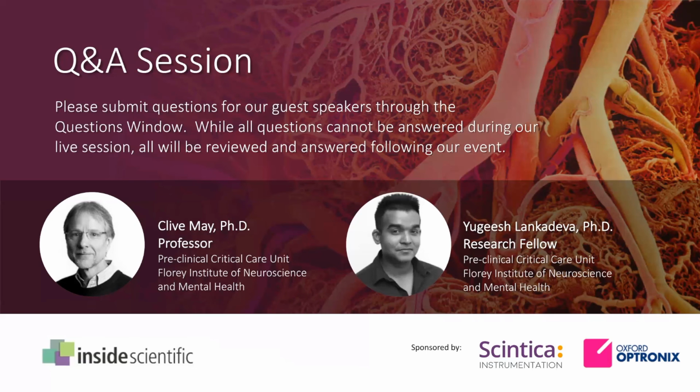Things like moving tissues, the heart, is challenging, obviously, by virtue of the fact that it's a moving tissue, but we've been successful in obtaining reliable oxygen readings from that tissue. In that case, however, perfusion readings using our laser Doppler monitors are challenging simply because the tissue is moving, and therefore it's very difficult to observe a baseline away from movement artifact. But bottom line, the monitors and these sensors can be used in a whole variety of tissue types.